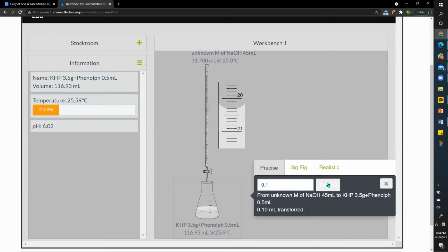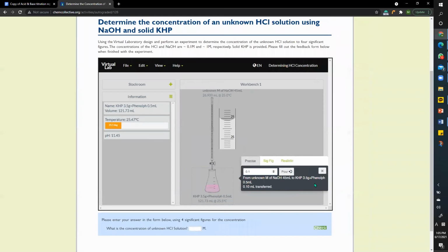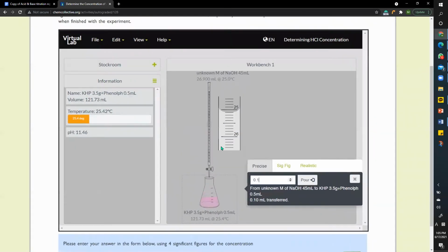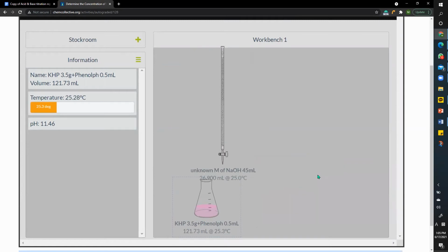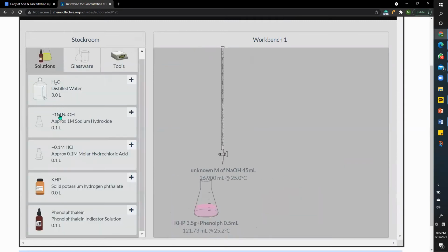And if you click once or twice more when the color has already changed, your data will not be accurate. So you should, oh my god, I missed it. Oh, okay. So this is the thing that you might do. So don't just talk, concentrate on the color change, okay? Yay, once again.